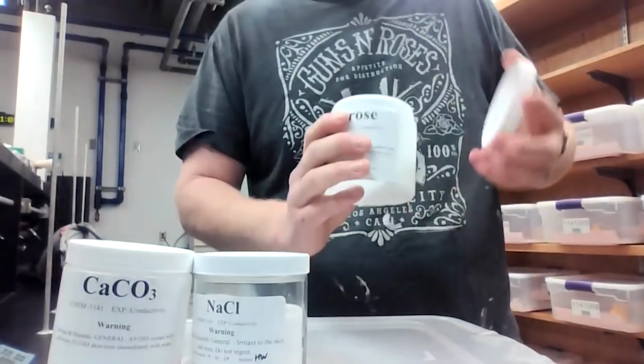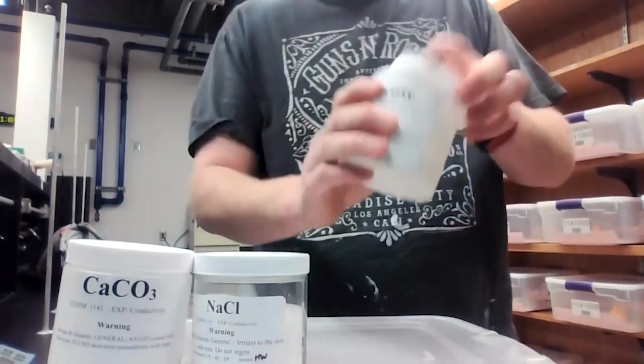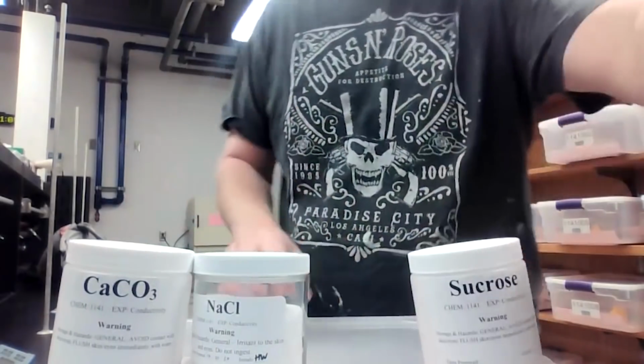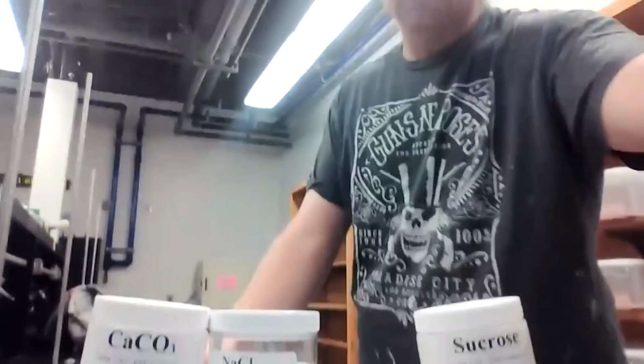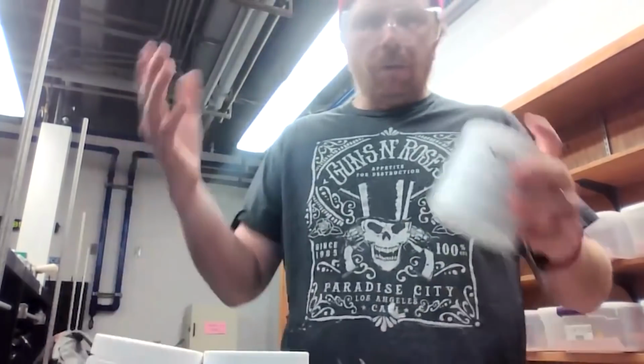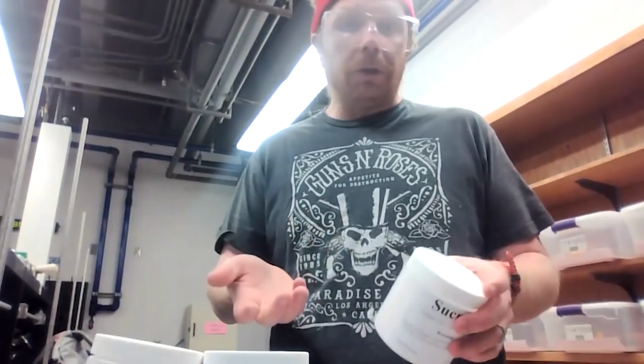This last one, sucrose. Sucrose is a solid. It is not an ionic solution, but rather it is a molecular solution. So what we're going to be doing is looking at the similarities and differences. On one hand, they look a little bit similar.